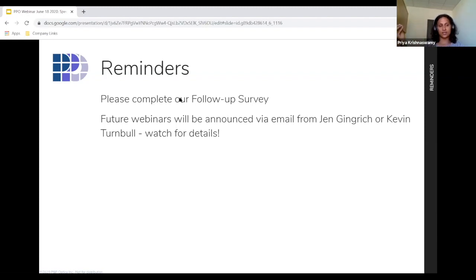And this would ensure that if there is a light that needs to be swapped, we can build it on our test check and we can swap it right back. And we can be certain that once everything is on, we can go back to the system as it was before. Awesome. Hope that helped clear the question.